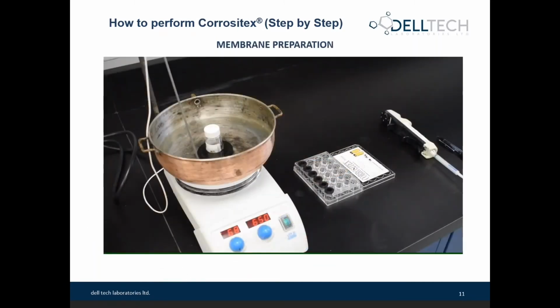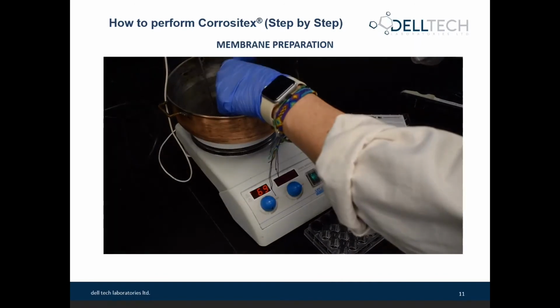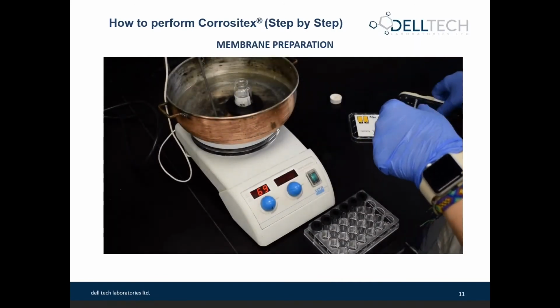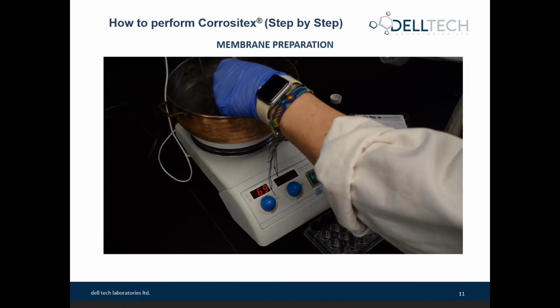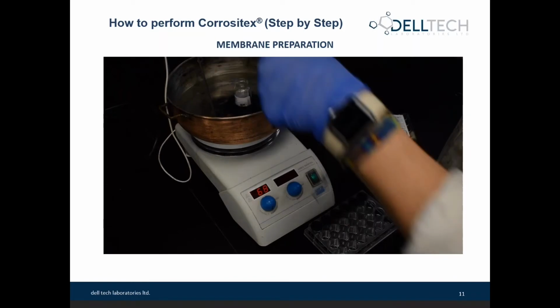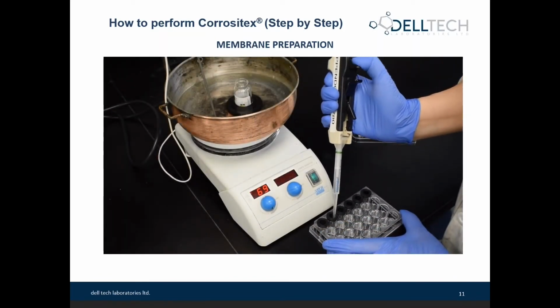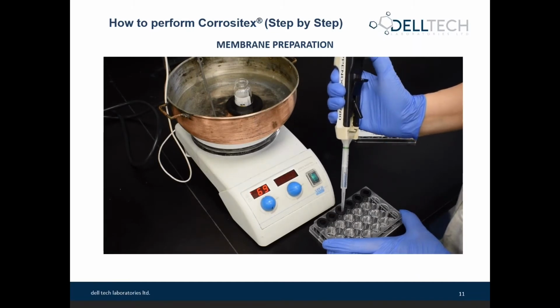In this video, we're going to show the membrane preparation where you pipette the BioBarrier matrix into the membranes that are shown in the little tray to the right there. So you would assemble your Eppendorf repeat pipetter. You fill it up. And then dispense 4 of 200 microliter aliquots to each of the membranes.